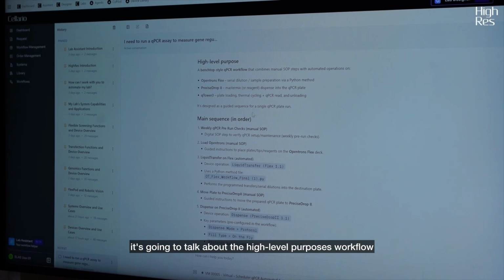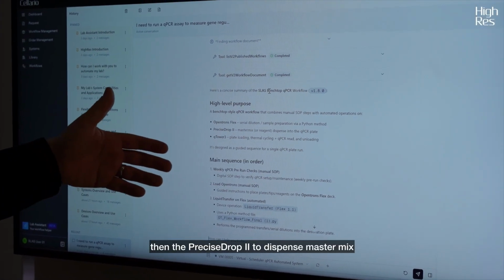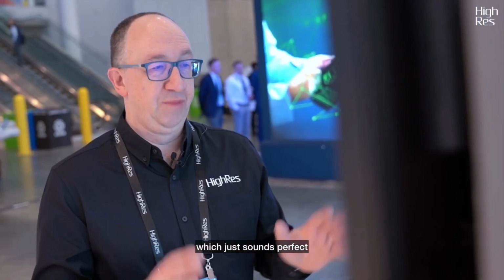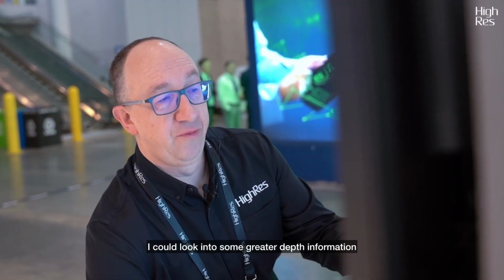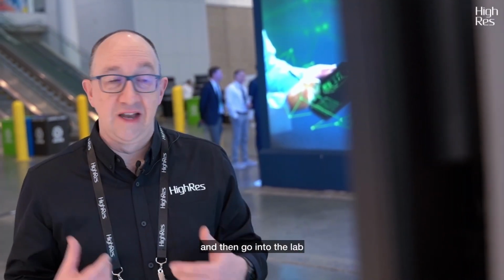So you can see here, it's going to talk about the high-level purpose of this workflow. It's going to use the OpenTrons Flex to do a serial dilution, then the Mantis Precise Drop 2 to dispense master mix, and then use the qTower to do some analysis, which just sounds perfect. That's exactly what I want to do today. If I wanted to, I could look into some greater depth information. We're not going to go through that now because we're going to commit this to an order and then go into the lab and actually run it.